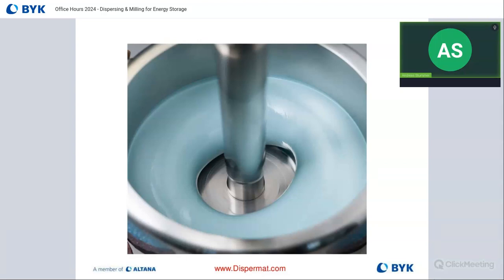Of course, there are going to be instances when you have really low viscosity materials where it's very hard to see a donut because the donut would collapse before it can even be formed. That doesn't mean that you are not dispersing properly. It just means you have very low viscosity. So you can play around with maybe a different blade diameter. But usually the donut is visible between 2 to 5,000 centipoise. You'll have no problem seeing a really good looking donut.